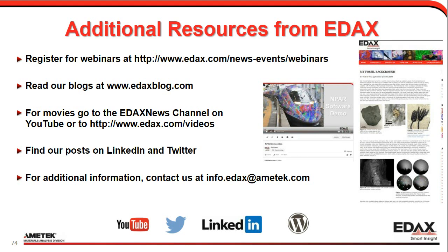In terms of dictionary indexing and NLPAR, I think it is a good idea to combine the two. That is something we haven't done yet, but we'll be working on to make that possible. Actually, no, it is possible. But you will have to be prepared. You will have to have some time. It's the kind of thing you might want to run over a weekend. So hopefully that's all helpful.